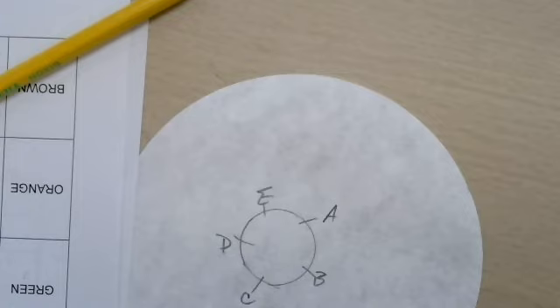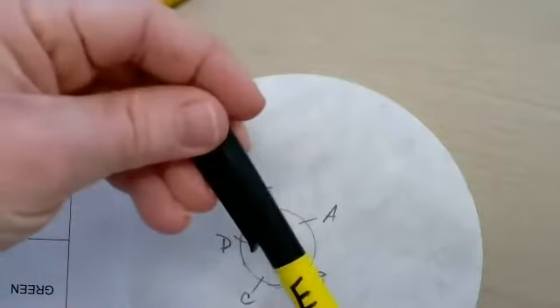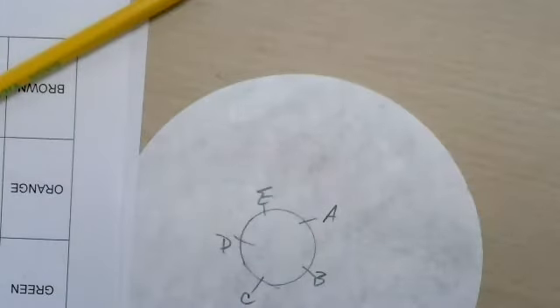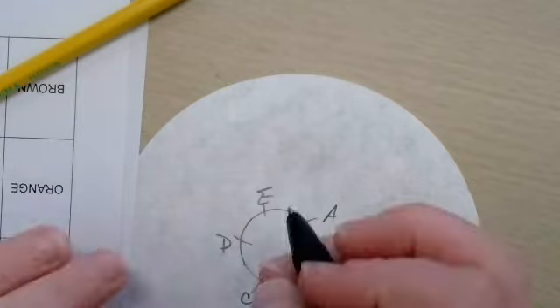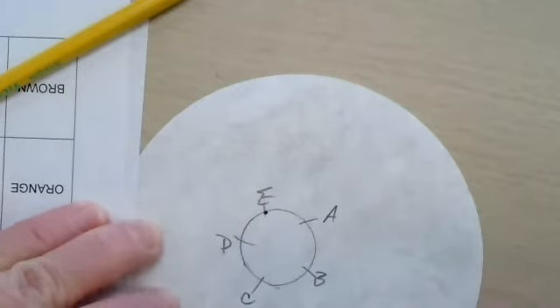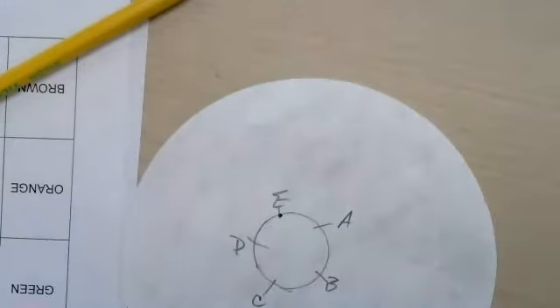The individual markers and pens have letters on them. So how do I know what is E? Well, there you go. All that you'll do is we only need one application. And as long as you can see the dot, you're good. So E, probably a little bigger. Good. And then I'll move to A and so on. You may have to kind of press down. As long as you can see the mark, you are good to go.